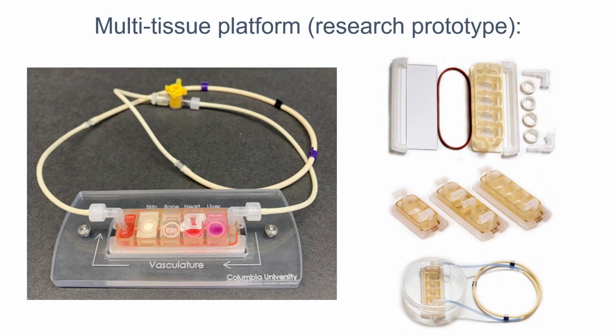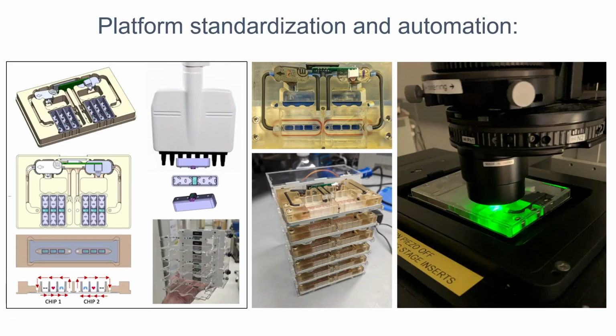It requires a lot of training to use this platform, and this is not something that you can start sending out to your colleagues and sharing data and experiences. So we started to work on turning this into a user-friendly platform, which is really push button. So it has an onboard micro pump.